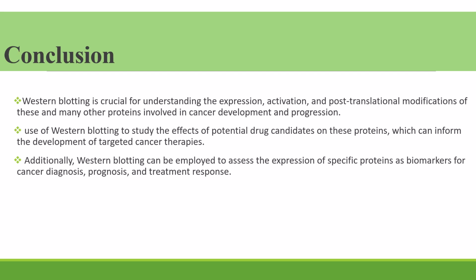In conclusion, the important thing I have to say is that it is crucial for understanding the expression and activation, post-translational modifications of these proteins involved in any study, not only in cancer progression. Any disease you are targeting, you have to run Western blot. Use Western blotting for potential drug candidates, you have to perform it. For checking what drug I have made, if you are a chemist and you have developed a certain drug, you have to go for the cytotoxicity study. You can go for Western blotting, you can check if the expression of this particular protein is going up or down.